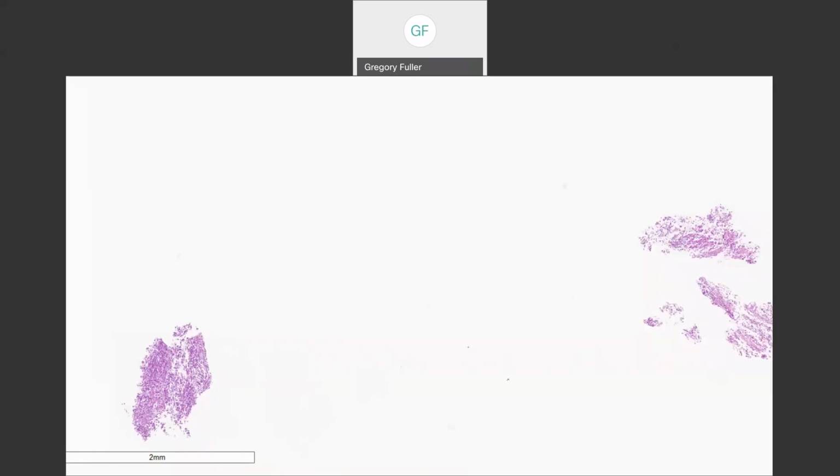Question: with this tiny little, maybe 2 millimeter specimen, is it possible to get cytologic information, or do you just have to freeze it if the surgeon's asking for intraoperative consultation? Well, I just showed you it's possible. It's beautiful. All you really have to do is a drag or a touch. Dr. Cathcart says do a touch. Yes. Look, listen, here's how you work it.